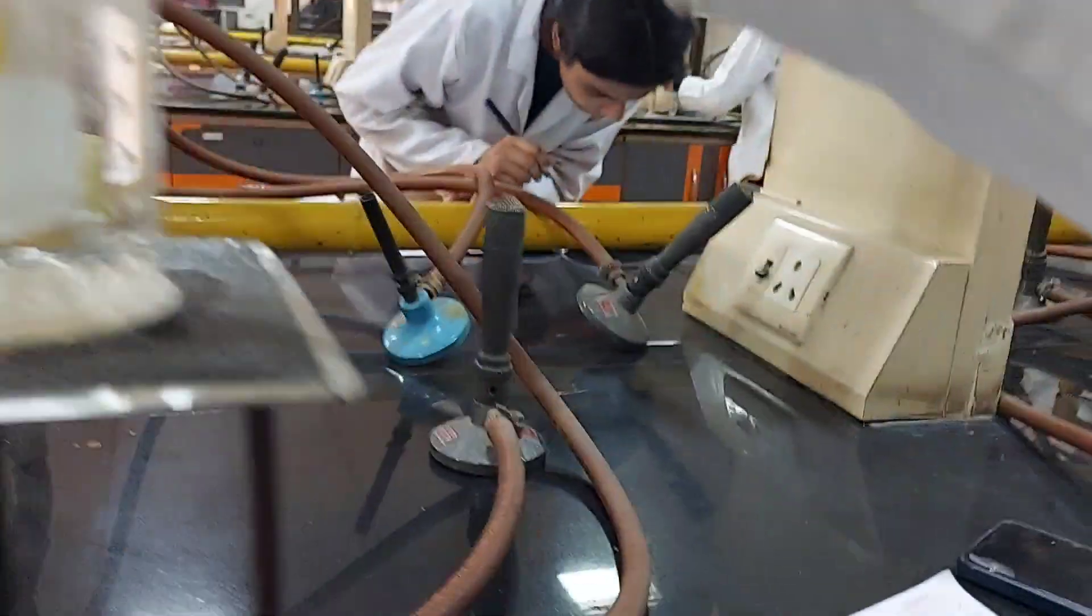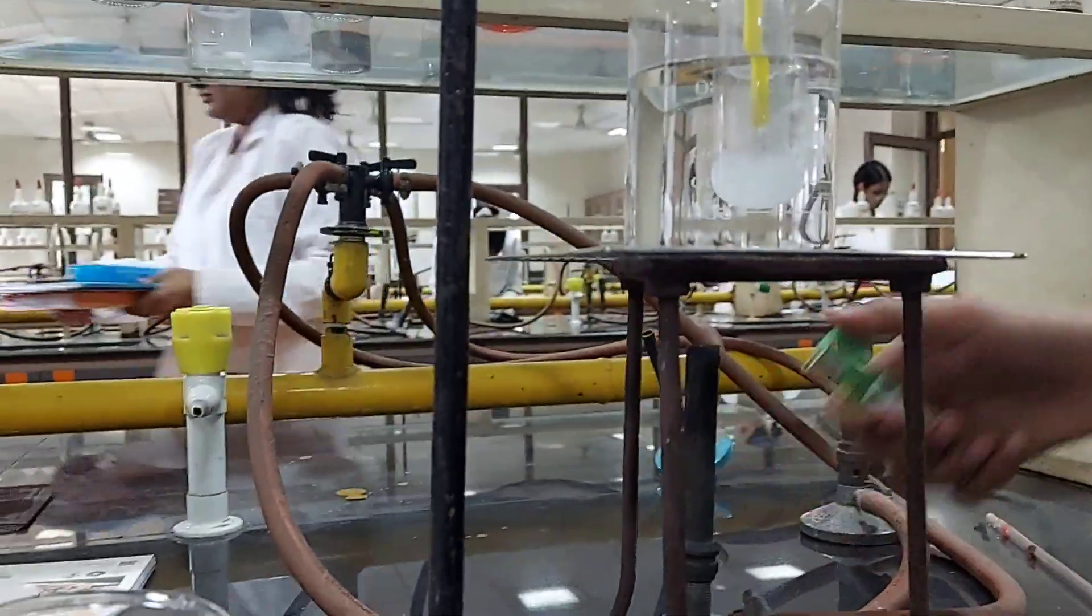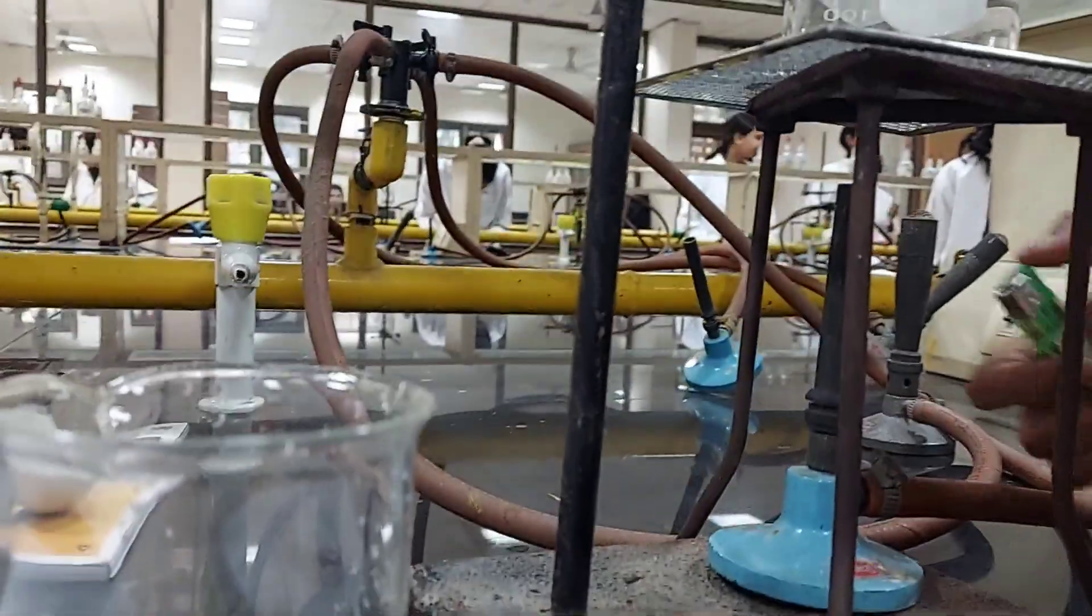With each addition of water, we stir and check for turbidity. If turbidity appears, we warm the water bath with constant stirring of the phenol and water mixture. Then we remove the burner when turbidity disappears.